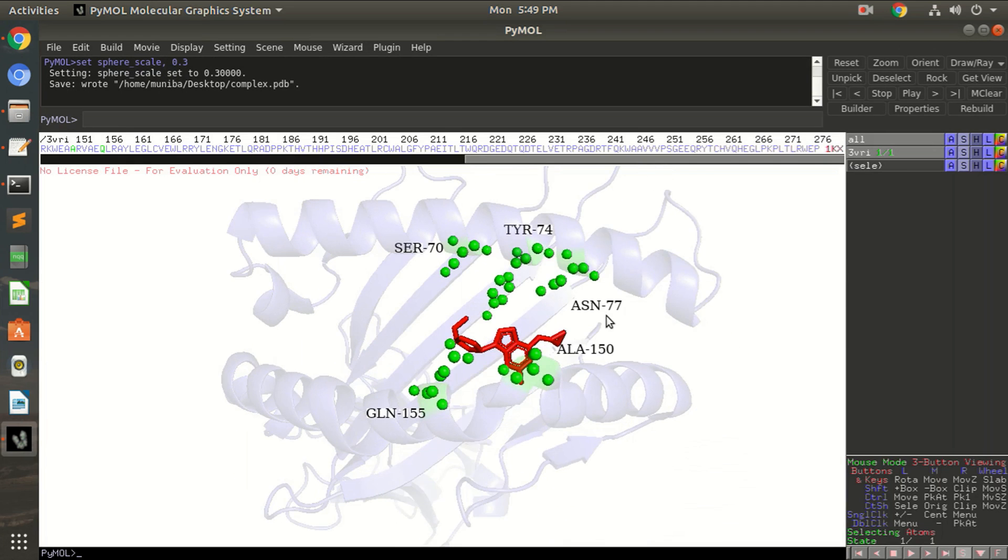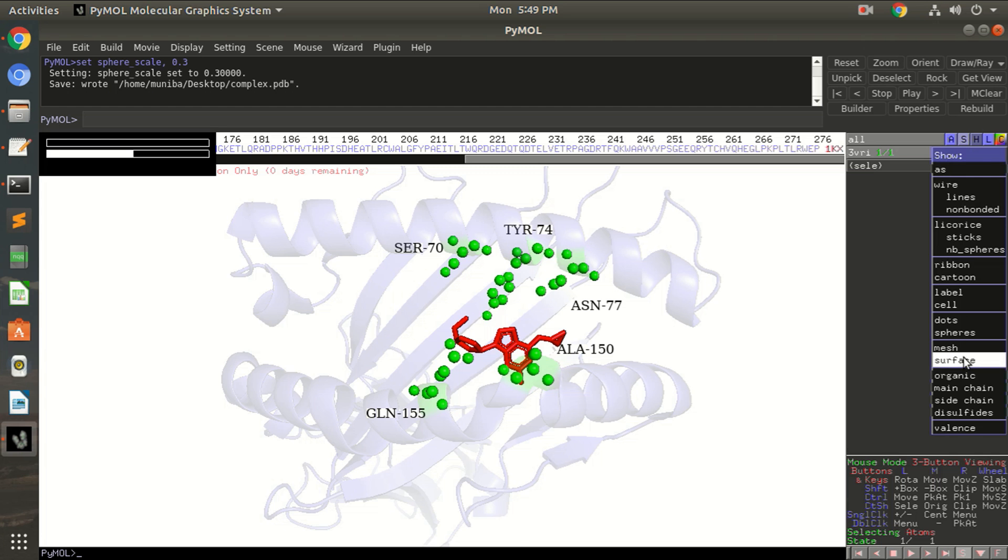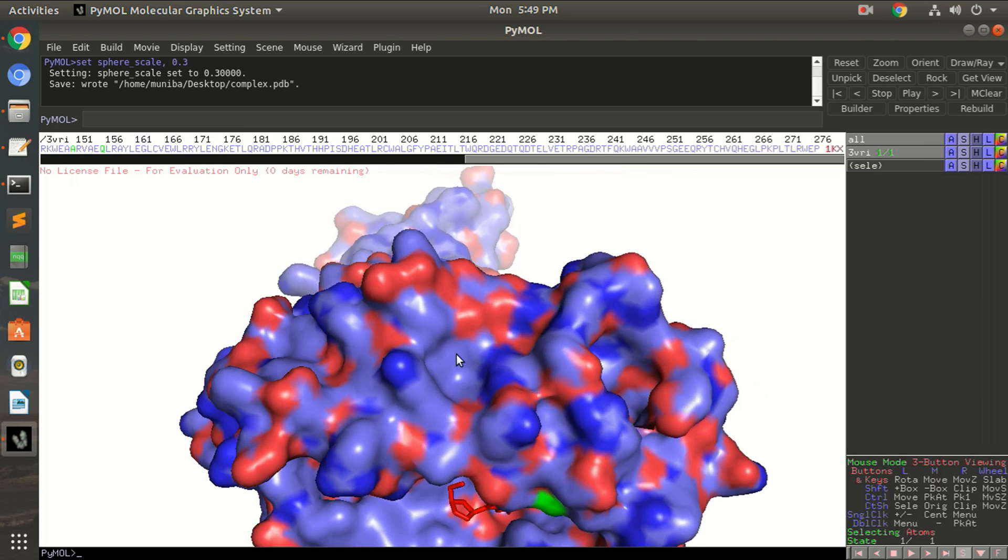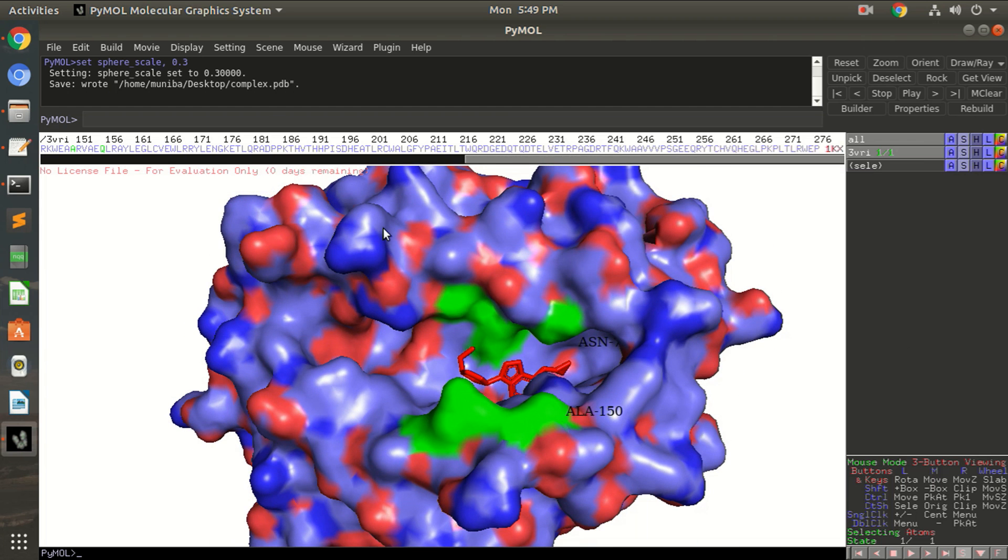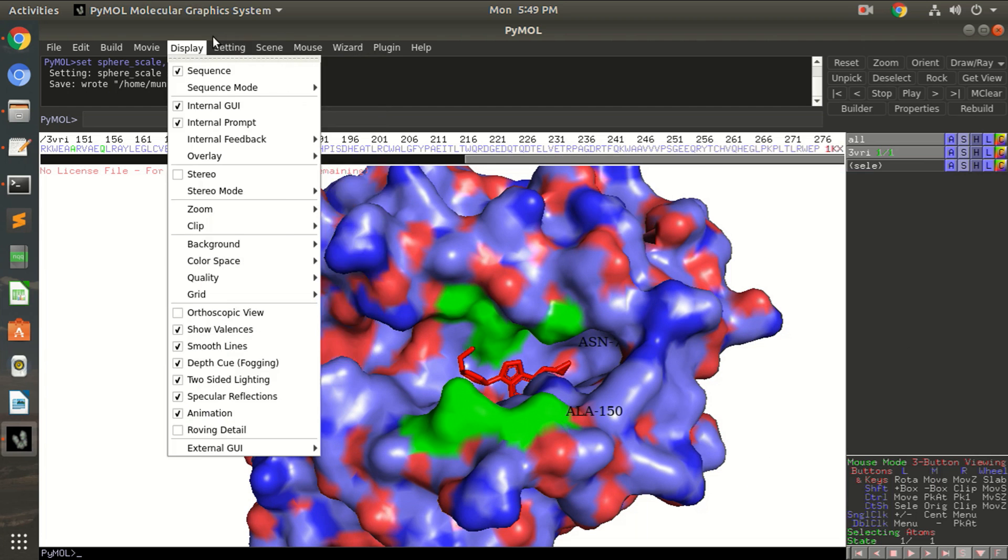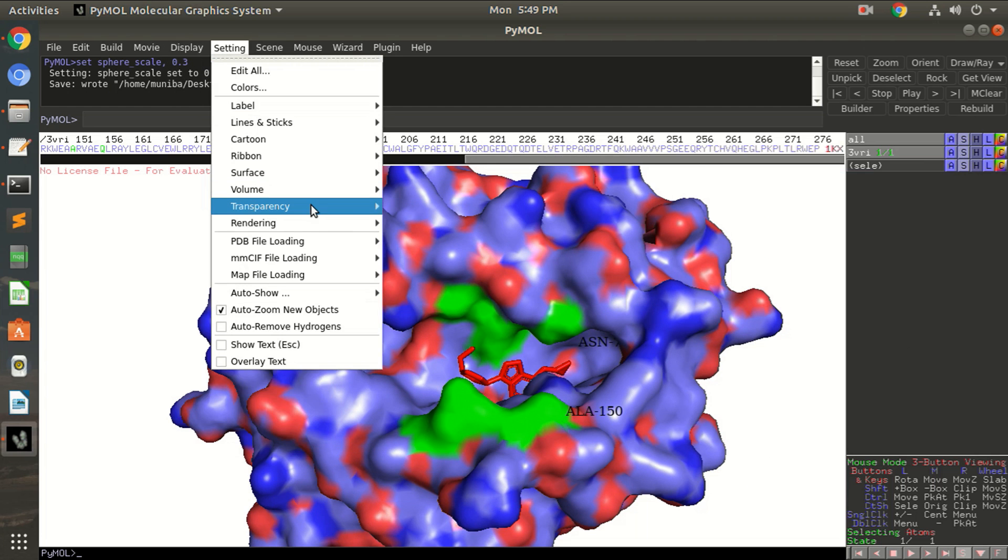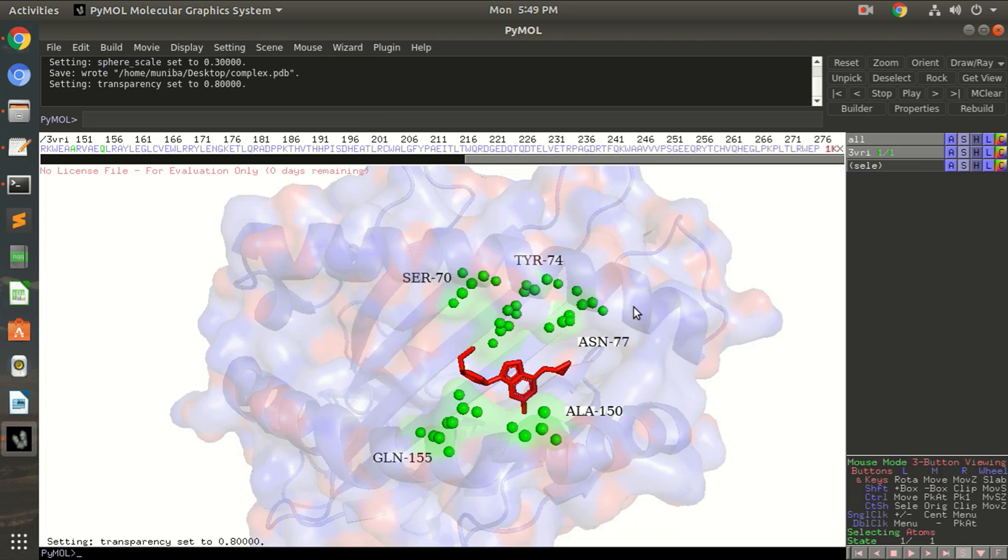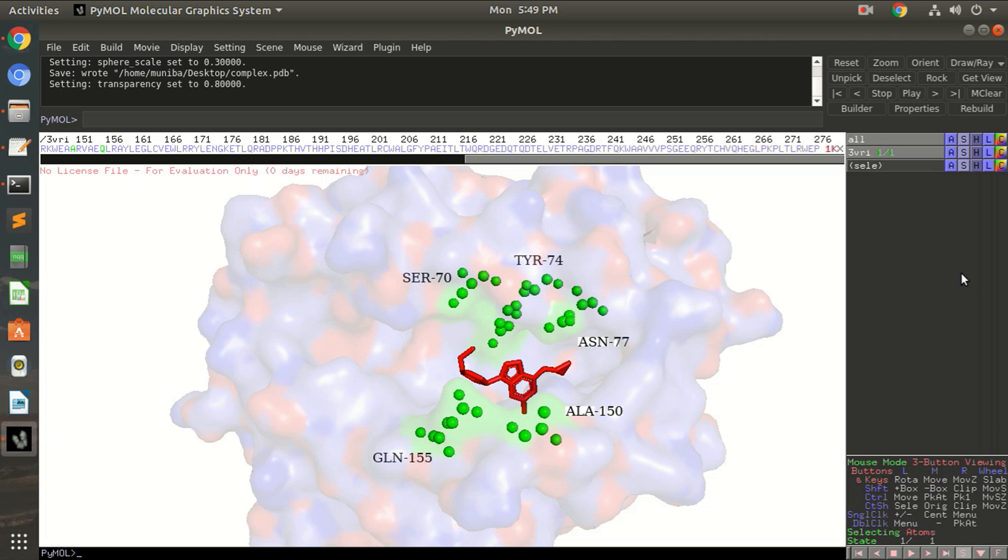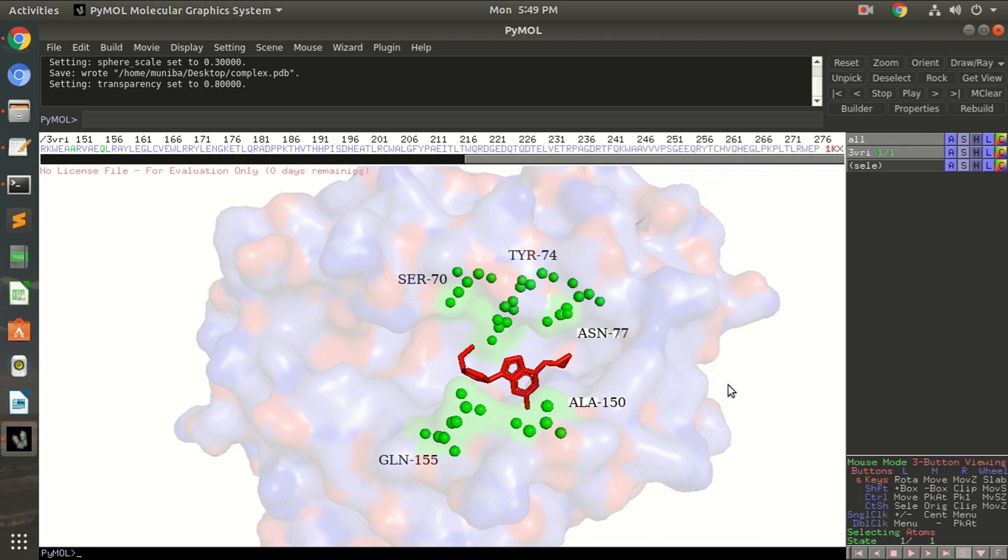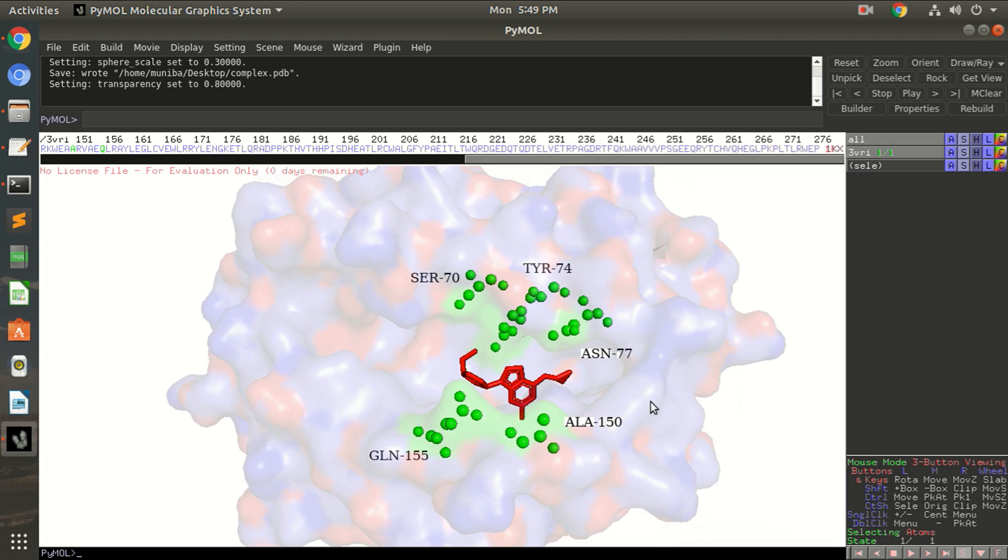All right, so the next thing you can do with PyMOL is you can change the protein surface. You can show the surface but again it's colorful so make it transparent again. Transparency, it's surface 80 percent. If you don't want to show the protein then hide the cartoon. Okay, and then we are back to this. Now in this picture you can easily visualize the ligand, the interacting residues and the label names.